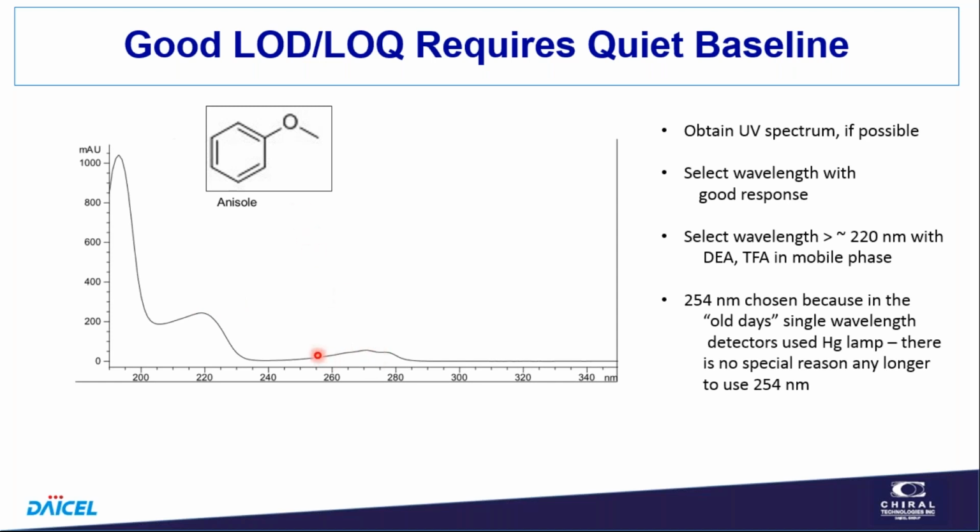Notice in aromatic compounds, we often see somewhere in here some absorbance by aromatic compounds. So if you have a lot of impurities that are aliphatic, and you just want to focus on the aromatic compounds, you might want to use this. But I think you should get a UV spectrum, so you deliberately choose a wavelength.